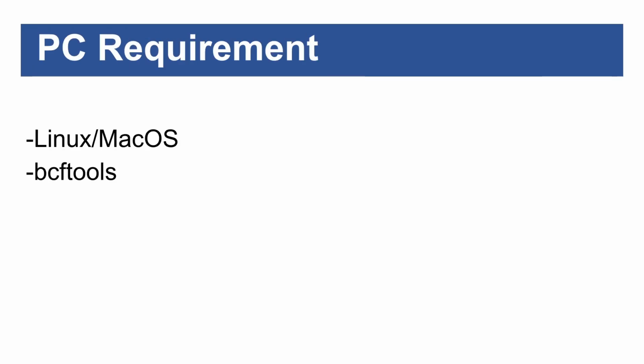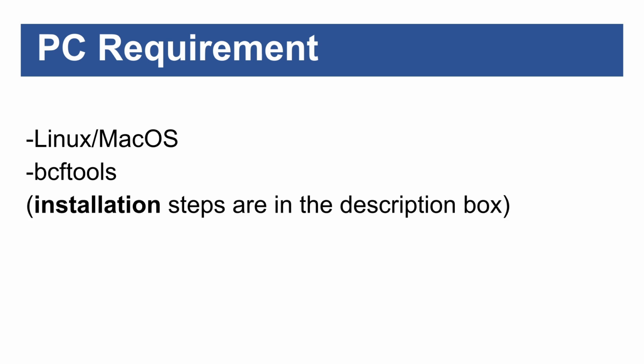In order for you to follow this tutorial, you need to make sure you have a Unix-like operating system, i.e. Linux or macOS. Any of these operating systems will be fine for this tutorial. In addition, you should have bcftools installed on that PC. And I have a separate tutorial that shows you how to install bcftools on your PC. So just watch that to set up your PC. Without further ado, let's start the exercise.